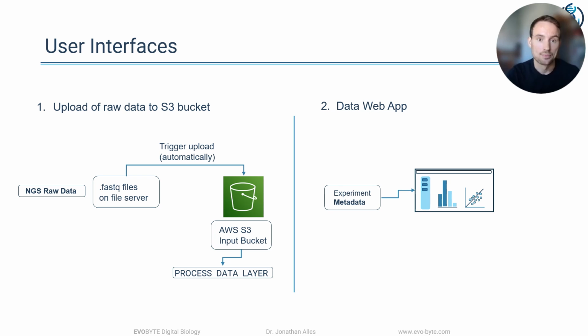And first, regarding the raw data, those would be the FASTQ files that are produced after demultiplexing the actual sequencing runs. And I mean, typically these FASTQ files would reside either on the sequencer itself, if you have newer sequencer versions, or possibly in most cases on a file server that is somehow attached to the sequencer itself.